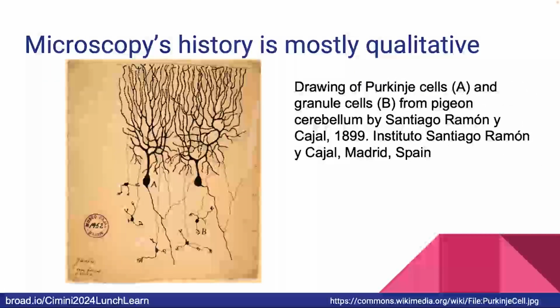But the problem that we face in microscopy and in bioimage analysis is that, historically, bioimage analysis is an add-on. Most of microscopy's history, and we've been doing microscopy for 400-ish years, was about drawing what you saw, evaluating first what you thought you saw and then writing it down or drawing it. So the historical bias for bioimage analysis is: we don't need that. We spent 400 years not doing it, so why on earth would we bother? Hopefully you will not think that by the end of this talk, if you do think it now. If you do think it now, it's okay. There's no judgment. But hopefully you will think that less by the end of the talk.